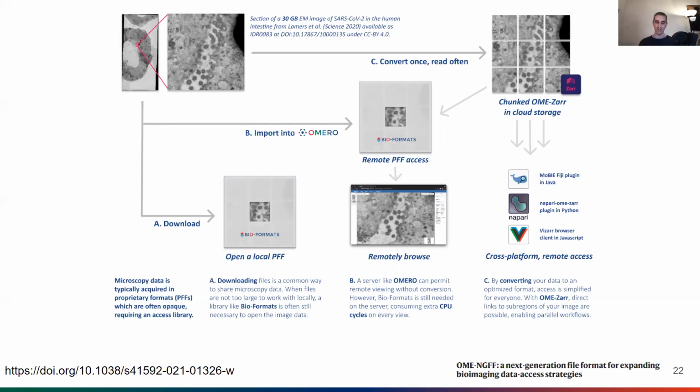So this is path A, a download path. The status quo is really that you download an image and you use Bio-Formats on the fly to look inside of it and figure out what's the data, what's the metadata, what can I do with this? What we are experiencing quite directly with the Image Data Resource, and other repositories will be running into the same problem, is that this is becoming a bottleneck, both maintaining all these different file formats, but also just in terms of speed. Trying to get access to your data is becoming more and more of a problem.